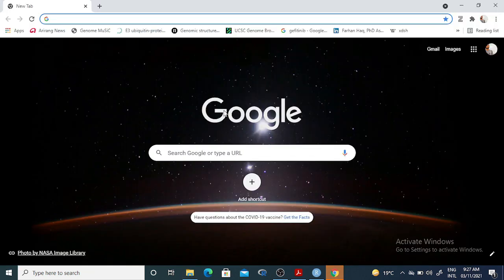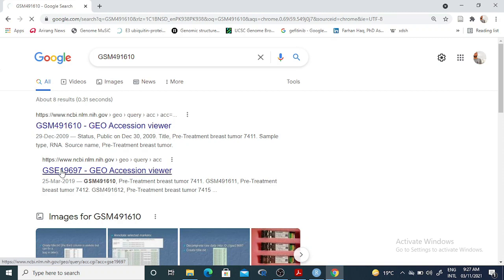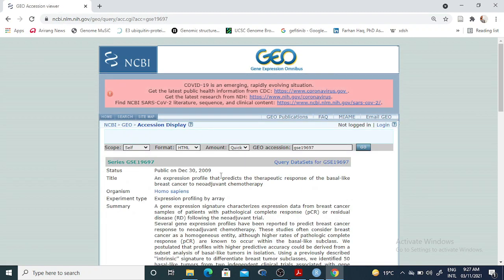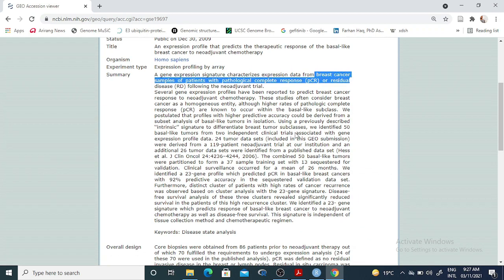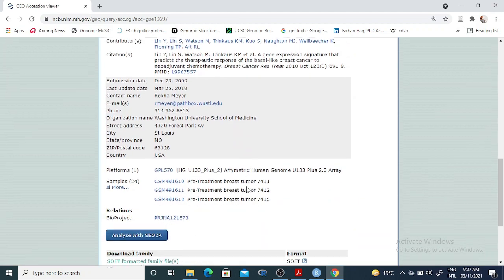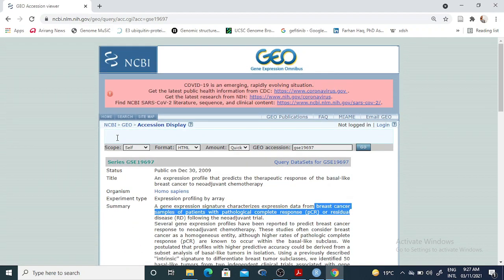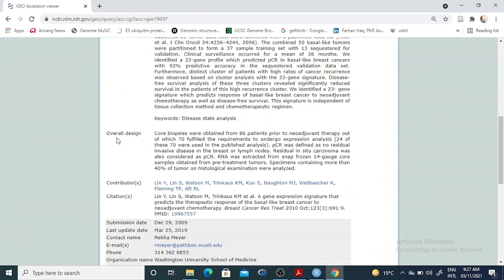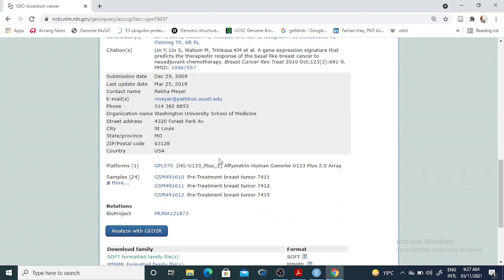If I just show you how I downloaded it — for example, I'm writing the name of one sample and searching it — you can see this is the ID. I downloaded it from this series, which is a breast cancer dataset with a total of 24 samples. I downloaded some part of that data, and this dataset belongs to the Affymetrix platform.